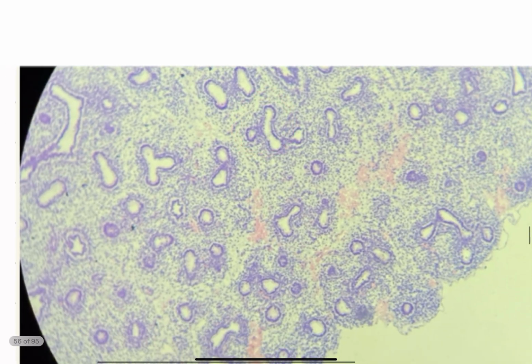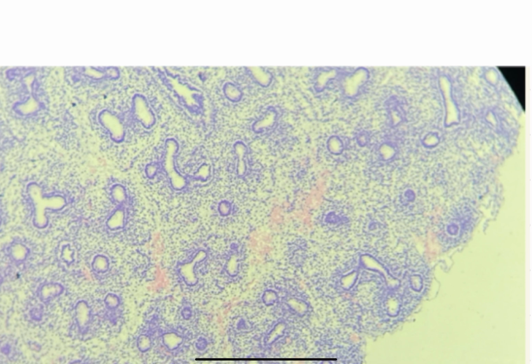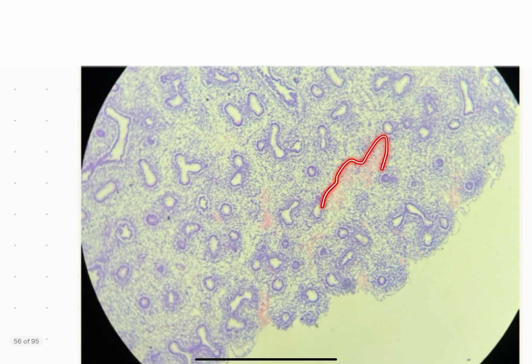You have that there as well, again almost like a Mercedes, like a three-headed arrow, like so. Then you have the blood vessels, which also could be something asked. I don't know if you need to use the word differentiating blood vessel in this case. The professor may ask you to write that down. But here, all of those red blood cells signify where the blood vessels are.